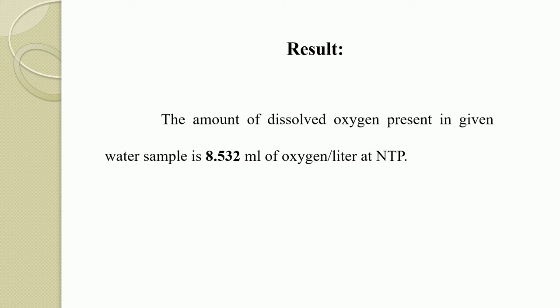In your journal, you have to write the aim, then requirements for this experiment, principle, observation table, and calculation, and lastly you have to write the result as written in this slide.